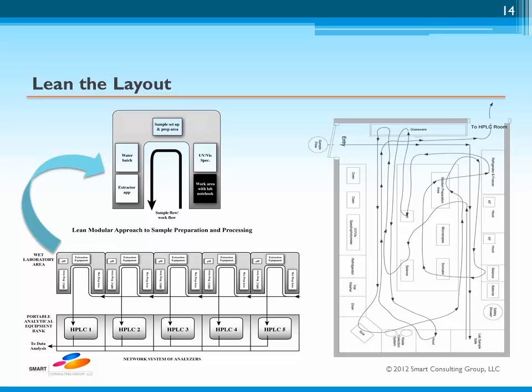The adoption of a cellular work pattern previously mentioned will provide a very significant reduction in the various waste components associated with the sample preparation. The GM layout is designed to focus all the key functions required to process a sample into a regular repeating unit. So what are the benefits?